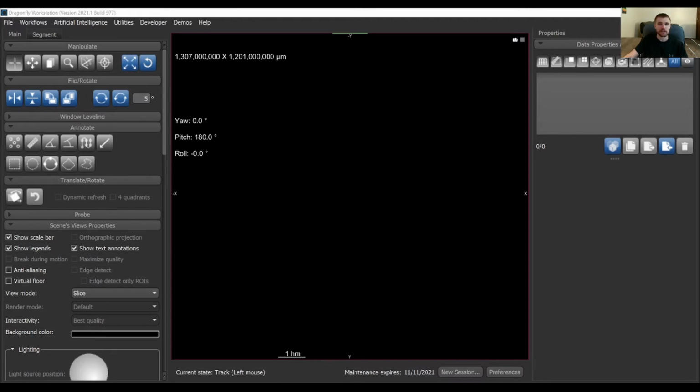I am a part of UIUC Chess, and today I'm hoping to explain to you the wonderful feature in Dragonfly called Segmentation Wizard. Segmentation Wizard is an incredibly useful tool for developing very quick, fast deep learning models that use neural networks that can be used for segmentation. It can also be used for other things like super resolution or noise removal. However, in my examples, I only ever use it for segmentation. So that's what I'm going to show you today.